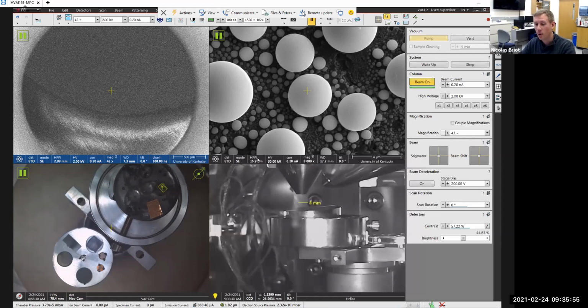The signal is always there. The detector that you buy is able to capture that signal. So you might very well use SEMs in your future that do not have that EDS capability. I would always recommend someone who buys an SEM to add that capability, even a low budget detector, because it's very powerful. But it's possible that you have an SEM without EDS. Now, you can never have EDS without an SEM. You need to have those X-rays created, and you create them with the electron beam.